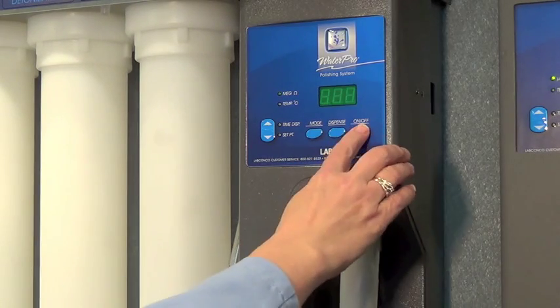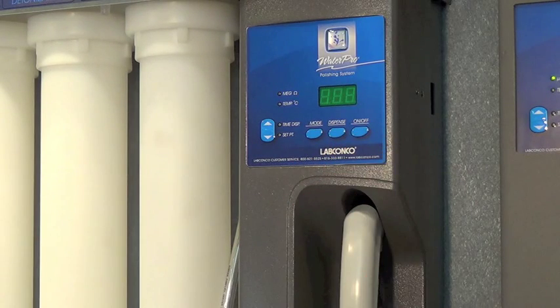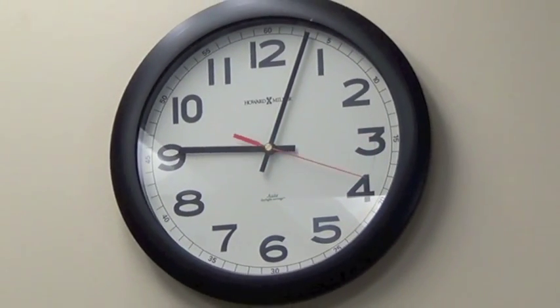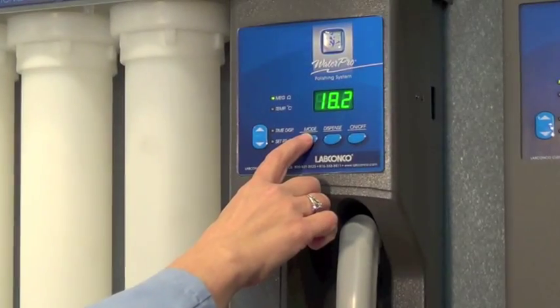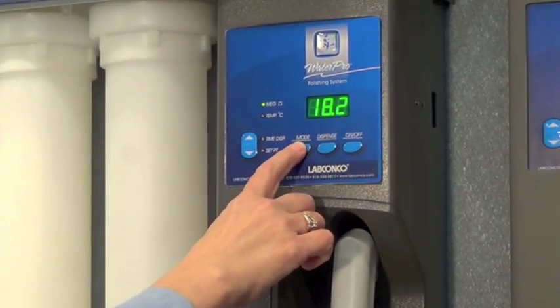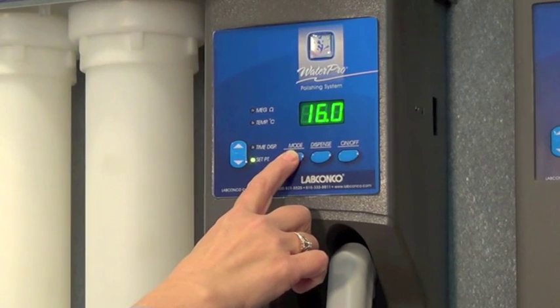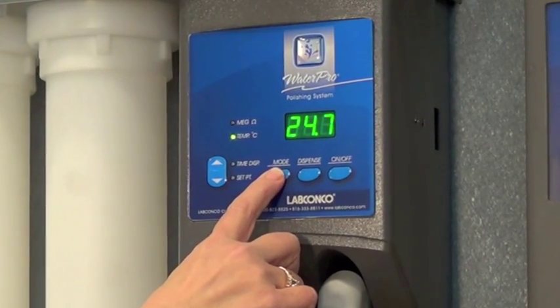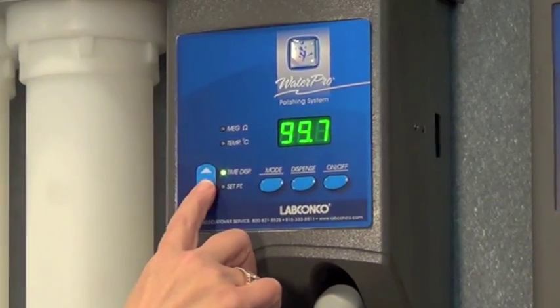When the switch is in the off position, the pump will automatically start and recirculate periodically to prevent the system's water quality from degrading. Pressing the mode button allows the user to toggle between display modes to see the water purity, water temperature, or the current time dispense setting.